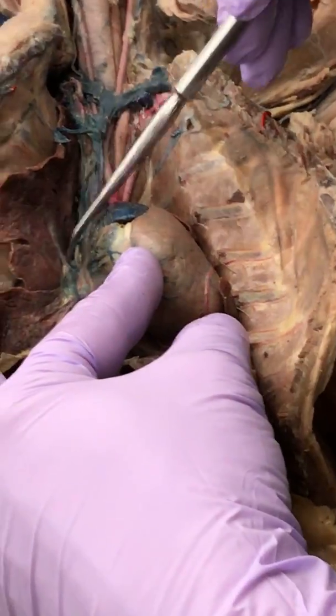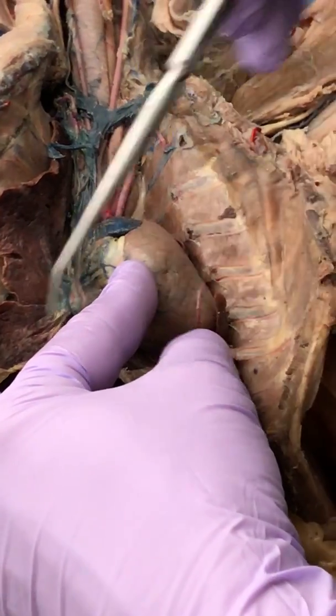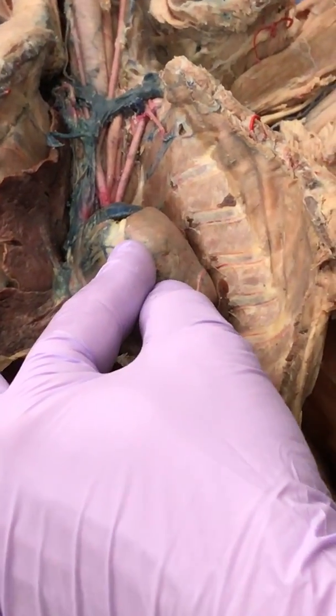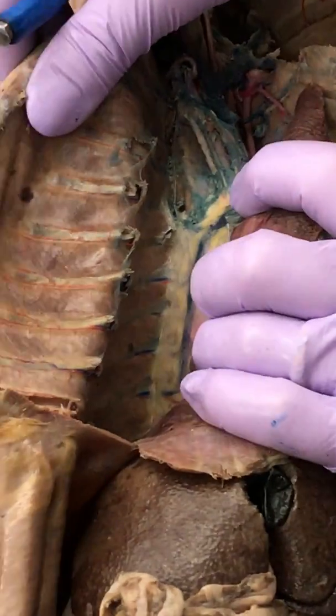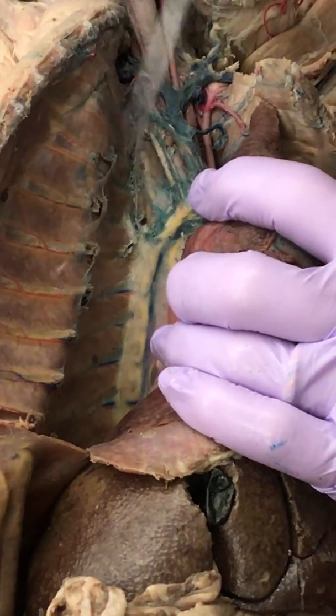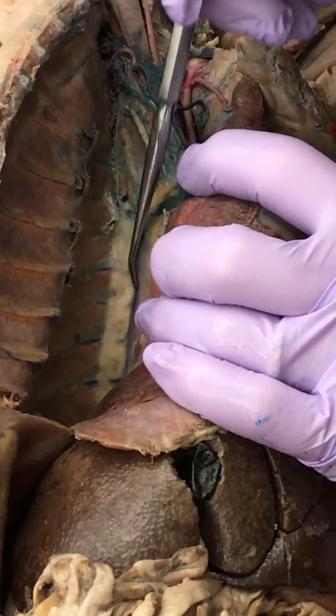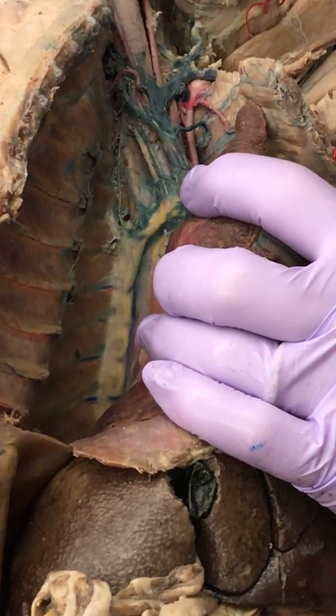So the veins coming out of your lungs aren't great. I think it was that cat over there that had the pink good ones. Yeah. Let's see what your azygous vein looks like. Oh yeah, you got a pretty good one. Yeah, a good azygous vein. Can you see that, Casey, right there? Yeah. So it comes up the right side. Just the right side.